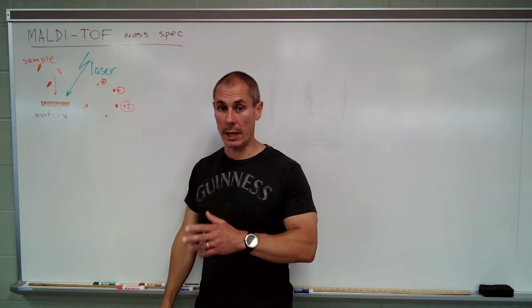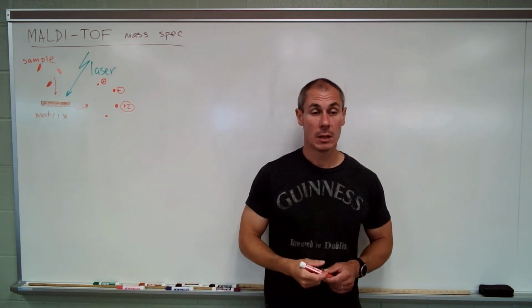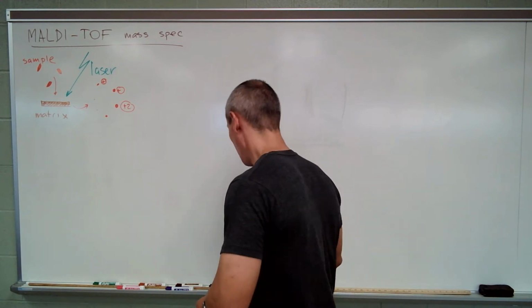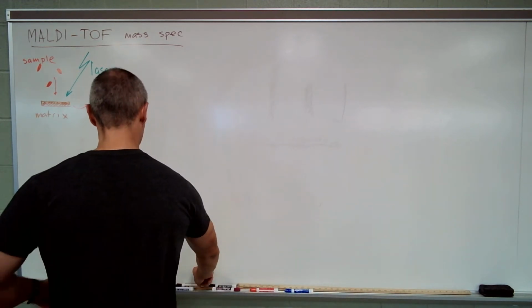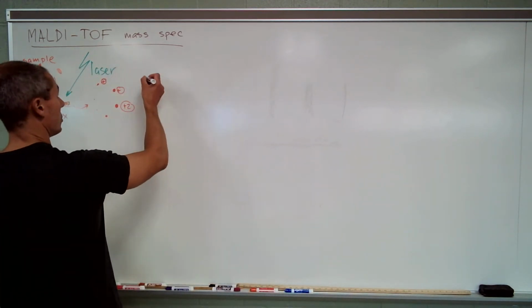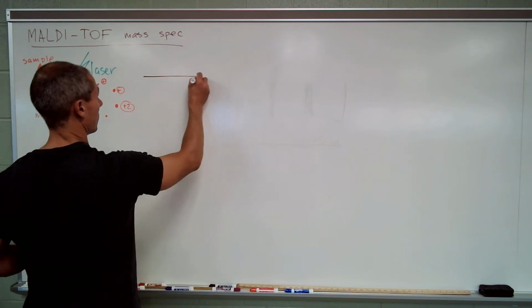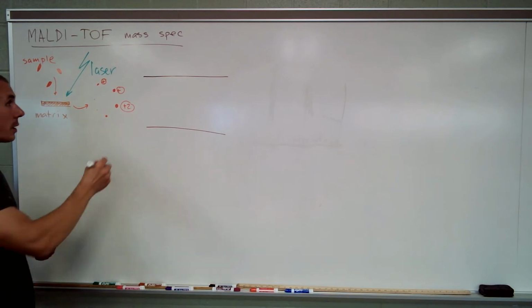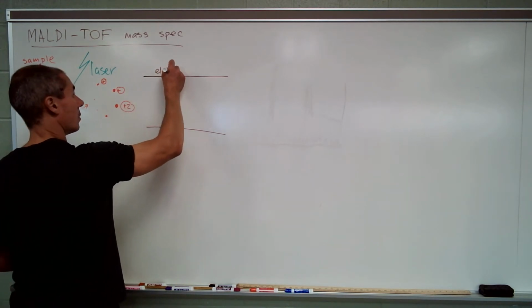Now what you do next with these particles with different size and charge? They enter a tube with electromagnetic field surrounding it.